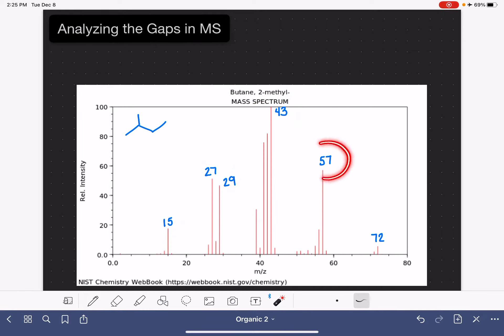So each one of these peaks represents a fragment of the molecule, like the molecule broke in half at some point, like maybe this bond broke right here, and the mass spec detected just this piece right there, or something along those lines. We can get some information about the carbon skeleton by looking at the gaps between these prominent peaks, also by looking at the distances or the gaps between our M plus peak and these prominent peaks as well.